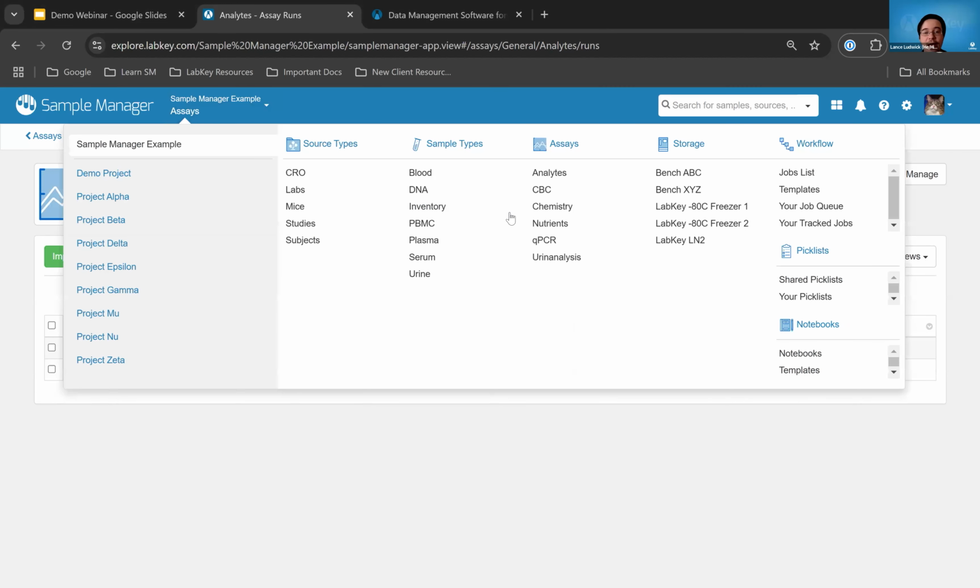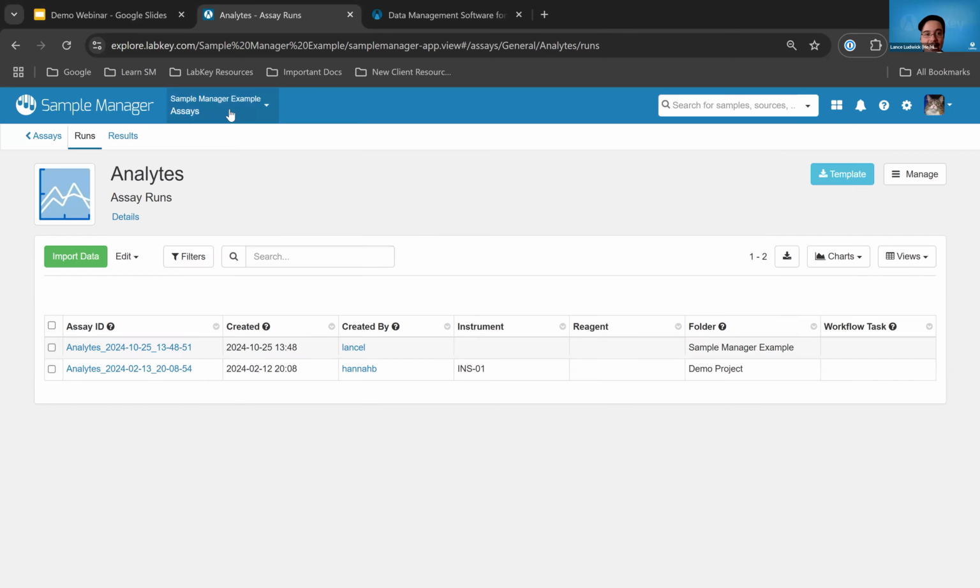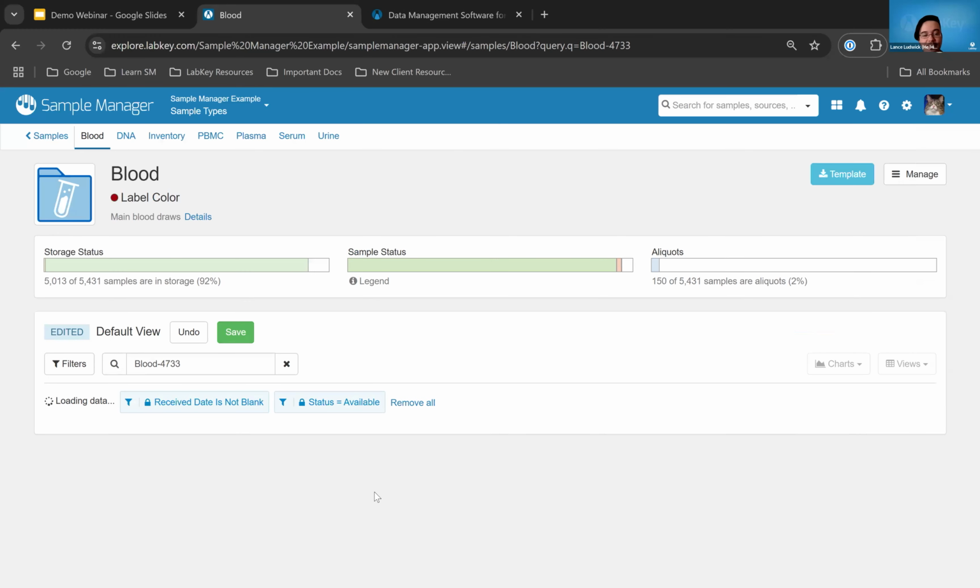And yes, we do have some pretty great tools to provide you with implementation. We have a data structure spreadsheet that helps you understand how your data should be formatted. And then we can also help, if you do have existing data, understand the best ways to implement that. So that would be a great resource to provide.